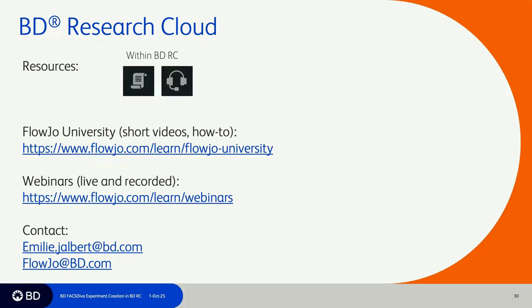There are lots of resources. The first two are the same that I mentioned earlier in the webinar. So FlowJo University, these are short how-to videos, 3 to 5 minutes on how to do common things like how to create an account, how to upload a cytometer, how to create a FACSDiva experiment, designing a panel, uploading data, connecting to FlowJo, all that fun stuff. Webinars like the one today go more in depth for a particular topic. And so you go here to sign up for a live webinar or watch the recorded ones.